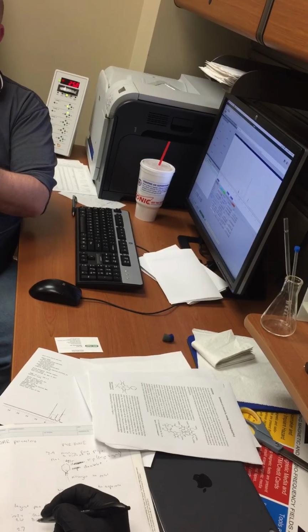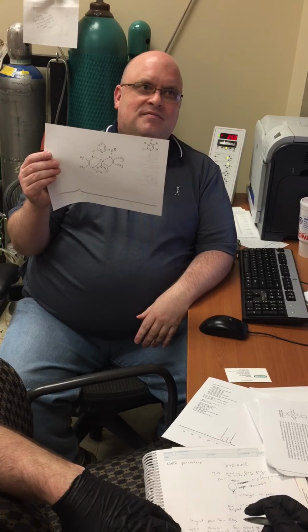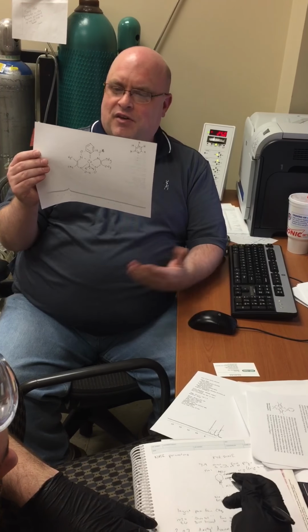If we had done this in, say, deuterated methanol, we wouldn't see those signals because the D in the methanol's OD would exchange with the H's here. And because the solvent's in huge excess, now all these are D's and you don't see anything, because we're looking for protons, not deuterons, or protiums, not deuteriums, okay?